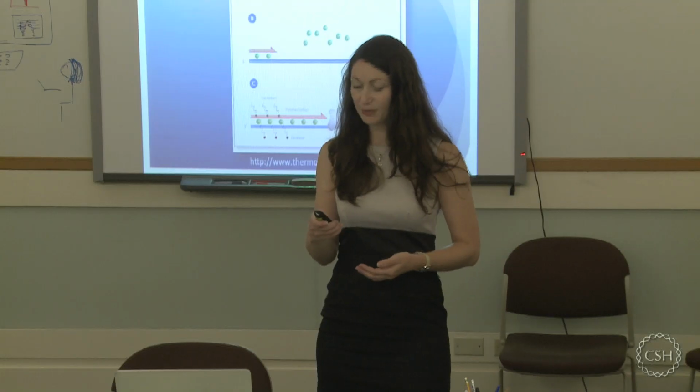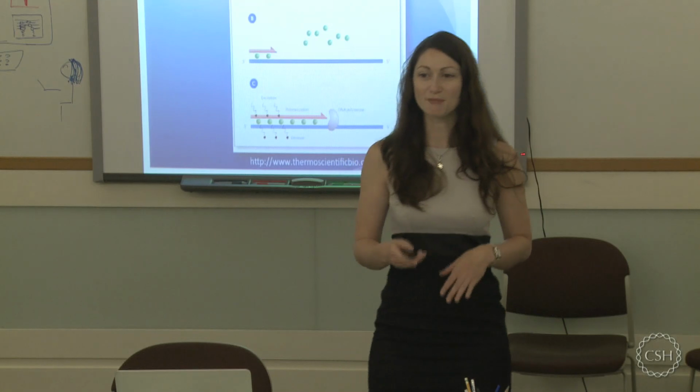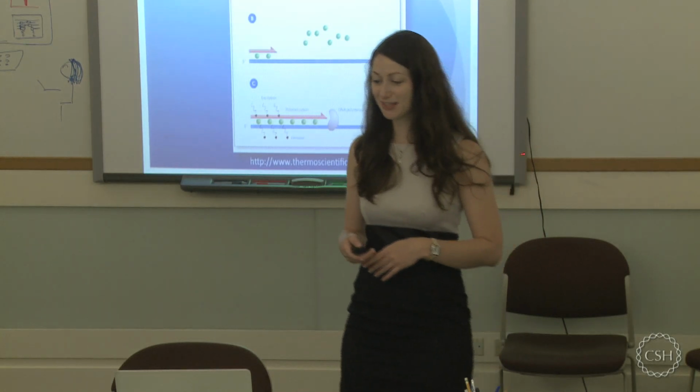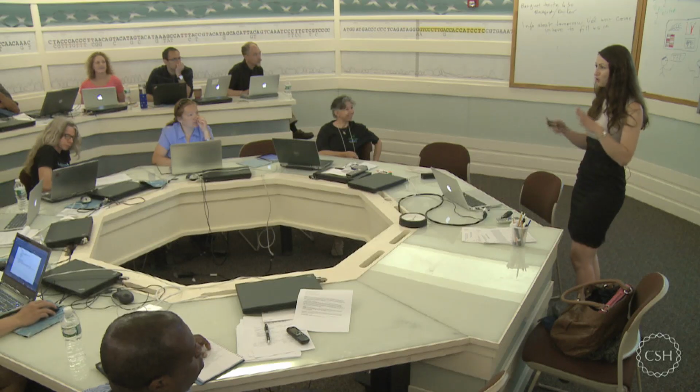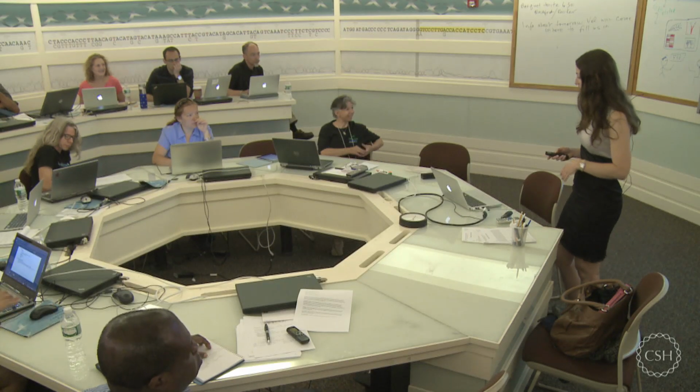Okay, now I was advised to give an introduction into primer design, so that's why I'm putting a lot of time into that now. I hope that's all right. Please, if it's all totally obvious, let me know.